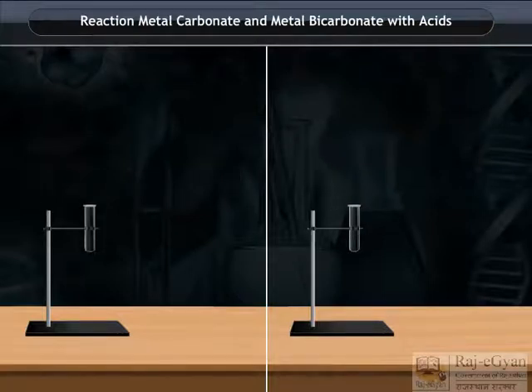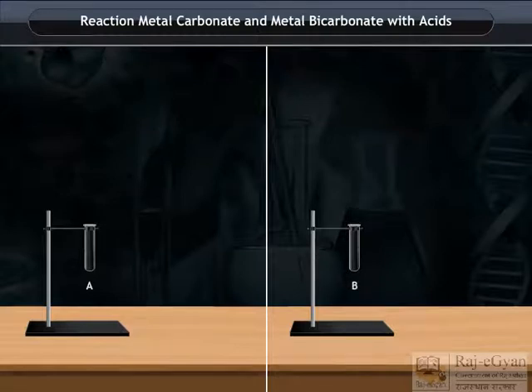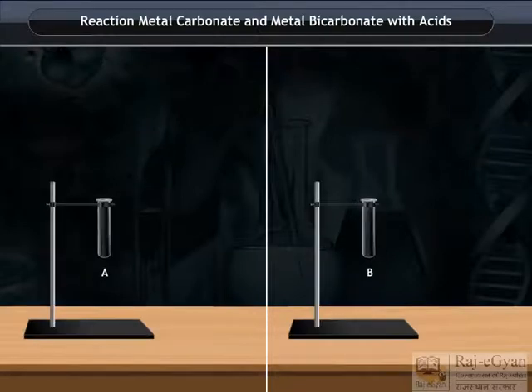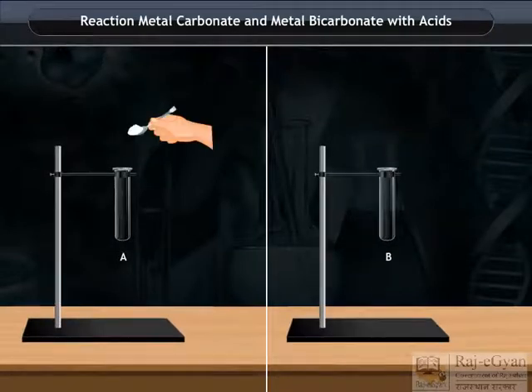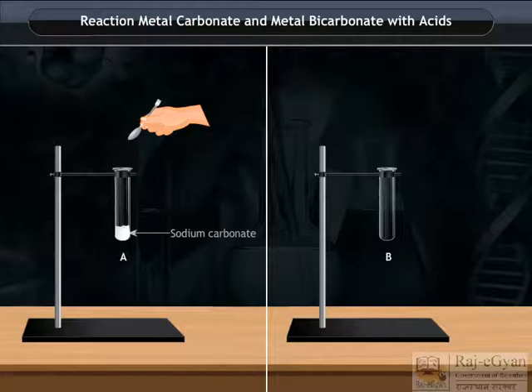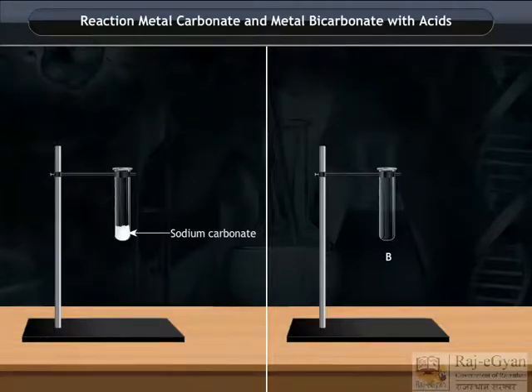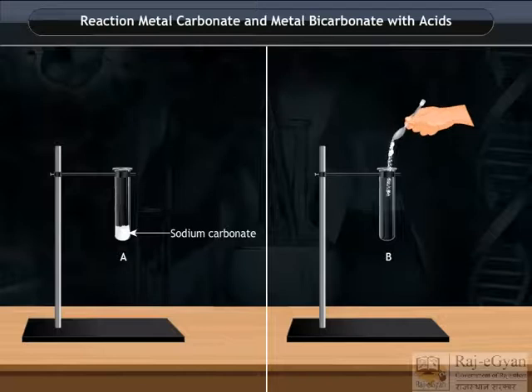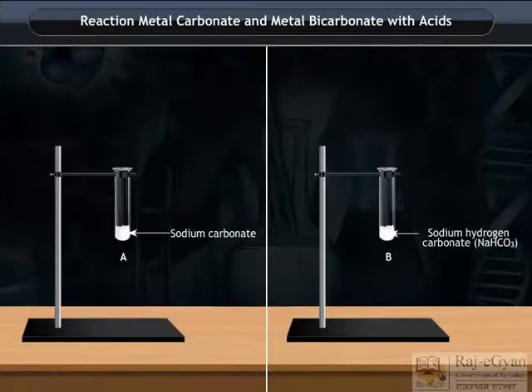Take two test tubes, label them as A and B. Take about 0.5 gram of sodium carbonate, Na₂CO₃, in test tube A and about 0.5 gram of sodium hydrogen carbonate, NaHCO₃, in test tube B.